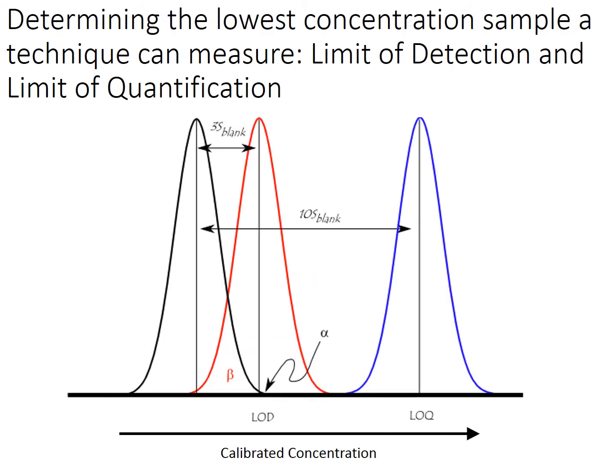So imagine we wanted to know the concentration of cadmium in river water. We would also want to measure the lowest concentration possible that we can measure. So we put into the mass spectrometer just pure water that we are sure had no cadmium in it, the cleanest water we could get. We'd measure that a bunch of times, and that would give us our blank measurement. This would be our average blank, and the measurements might vary by some amount.